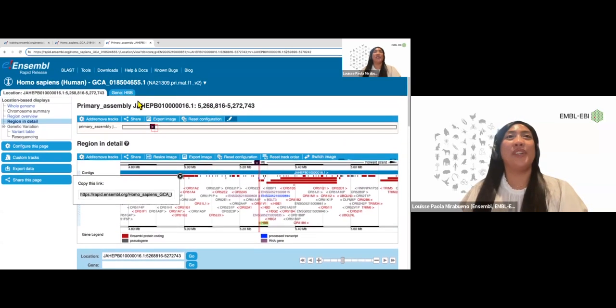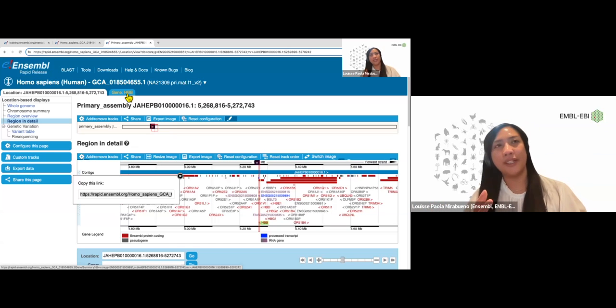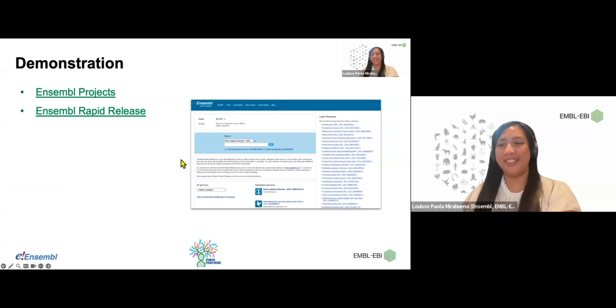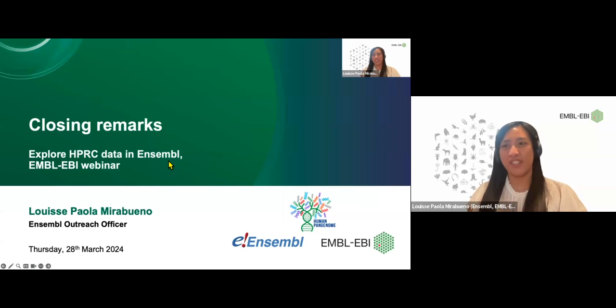Okay. So there's much more to explore for the data in the HPRC, but I think I'm going to stop there. I just wanted to give you an overview of how you can get started on exploring data from the different HPRC assemblies. So let me switch back to my browser, to my slides. And before we move on to the Q&A, I just want to finish up with some closing remarks.